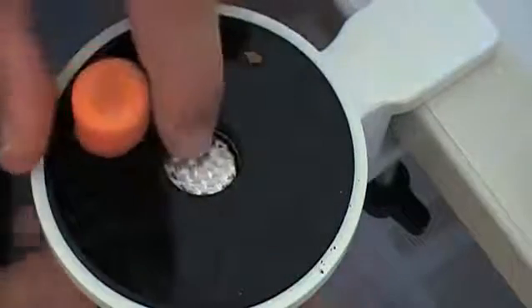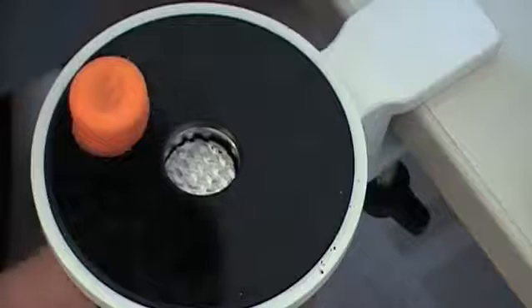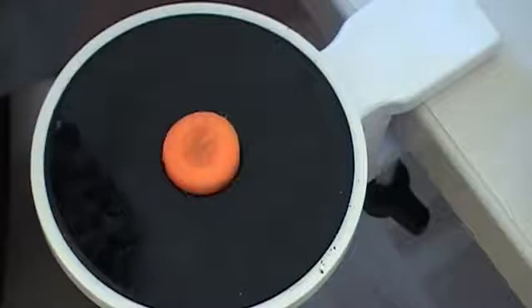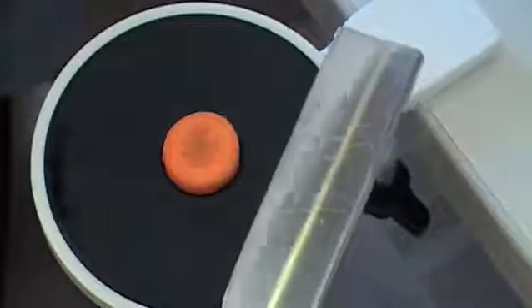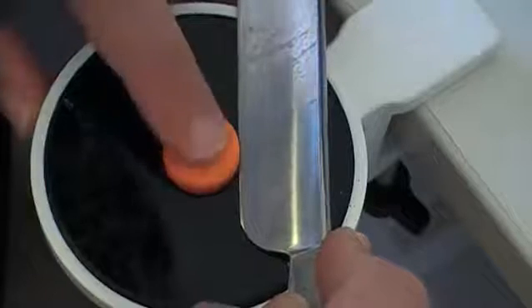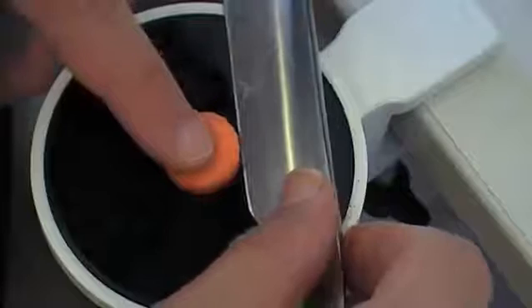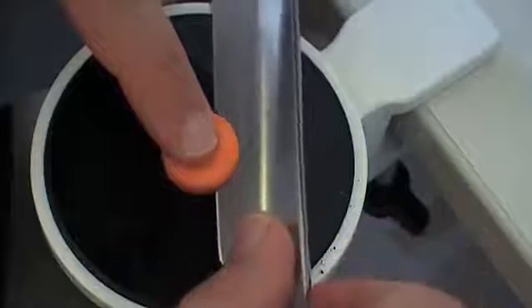I lower the central piston by turning the screw, and place the carrot into the specimen holder. Now I'm going to try my first microtome cuts. I take the microtome knife and carefully slice horizontally across the top part of the carrot. I found it's good to apply a little bit of pressure so that I do not lift out the carrot as I cut through it.